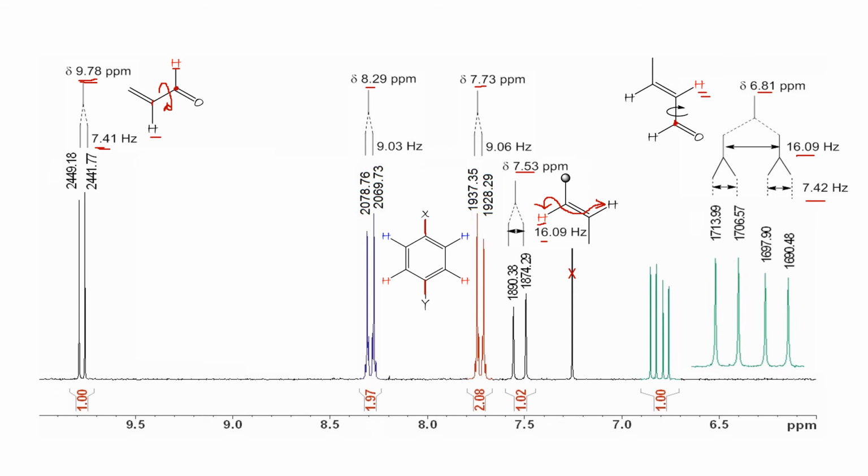Well, this is coupled to the aldehydic proton as well as to the olefinic proton trans. We have unsaturation. We have one here for the double bond, and a double bond here, another one, that is two, and we have here four for the benzene ring, that makes 6. So far from here we have 6. Let us see if we have one more.